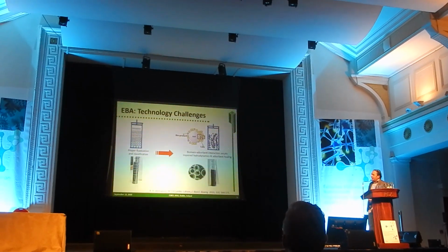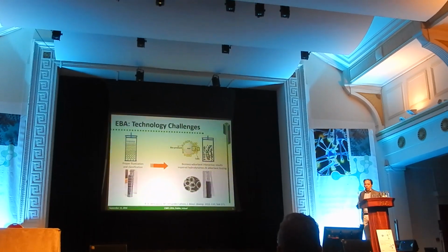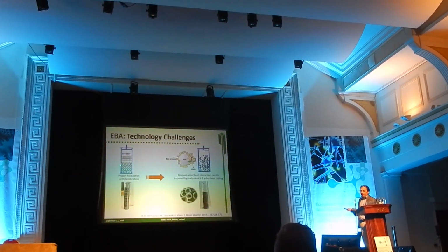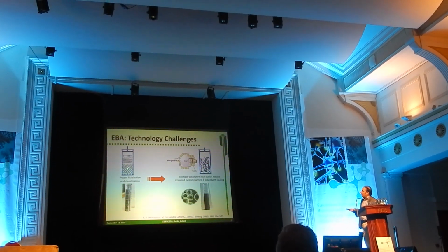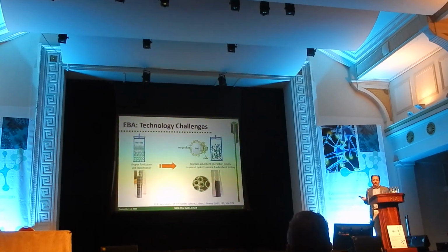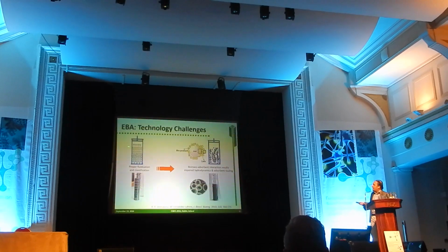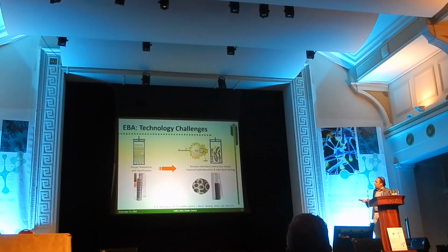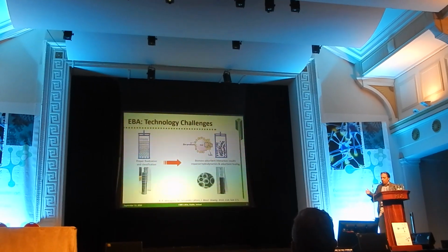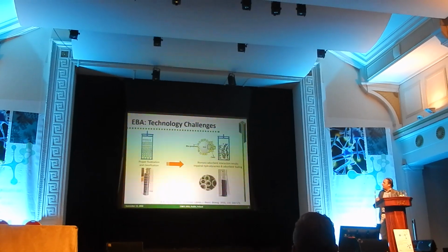Now, there is a problem here, and the problem is that for expanded bed to operate properly, you should get not only fluidization, so the particles are fluidized in there, right? You should also get a classification effect. So the classification effect basically implies that there is a restricted local mobility of these particles, the bigger ones at the bottom and the intermediate ones in the middle and the finest ones at the top of the system.